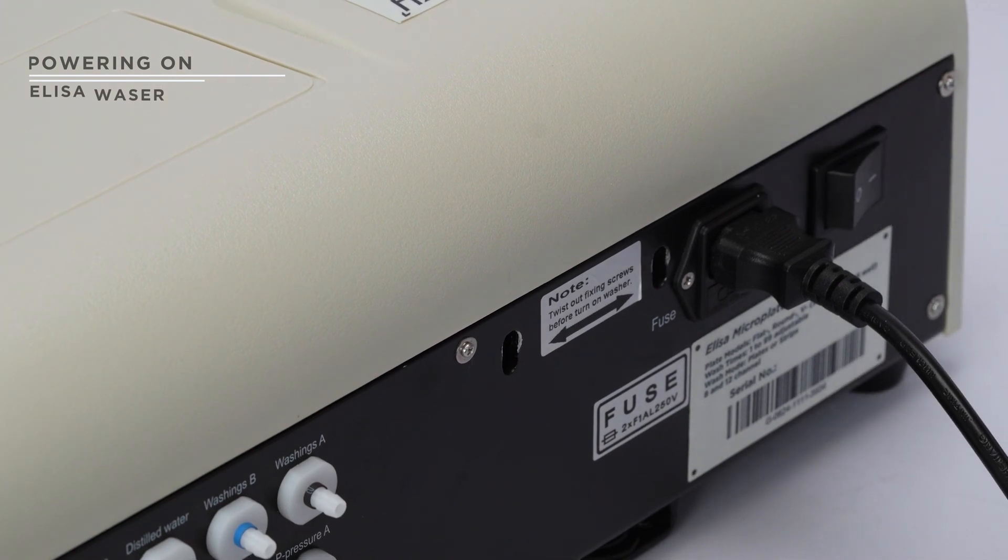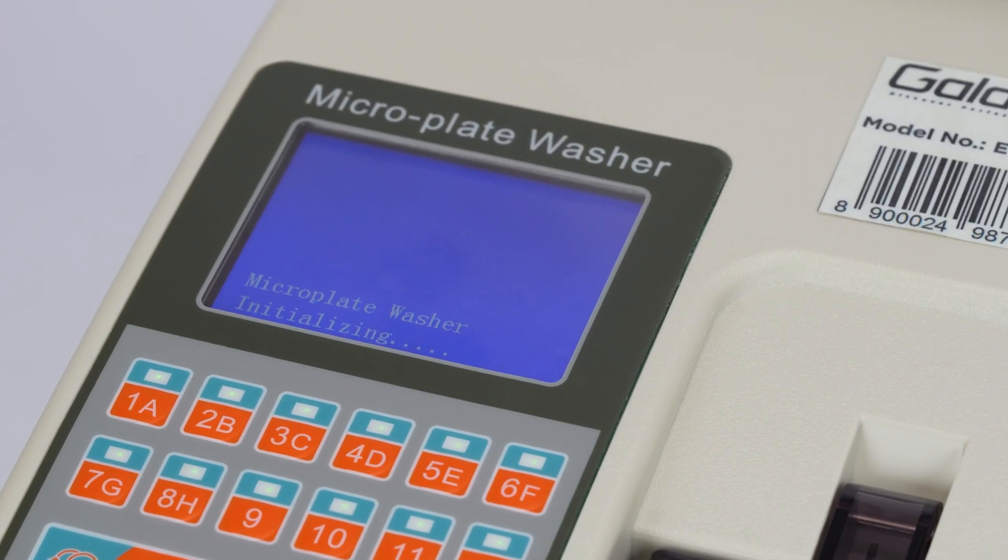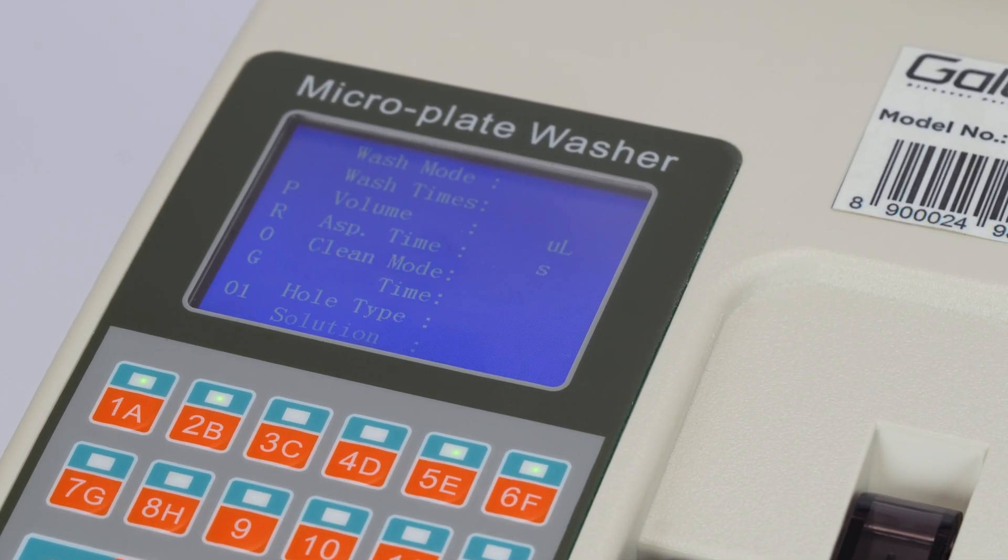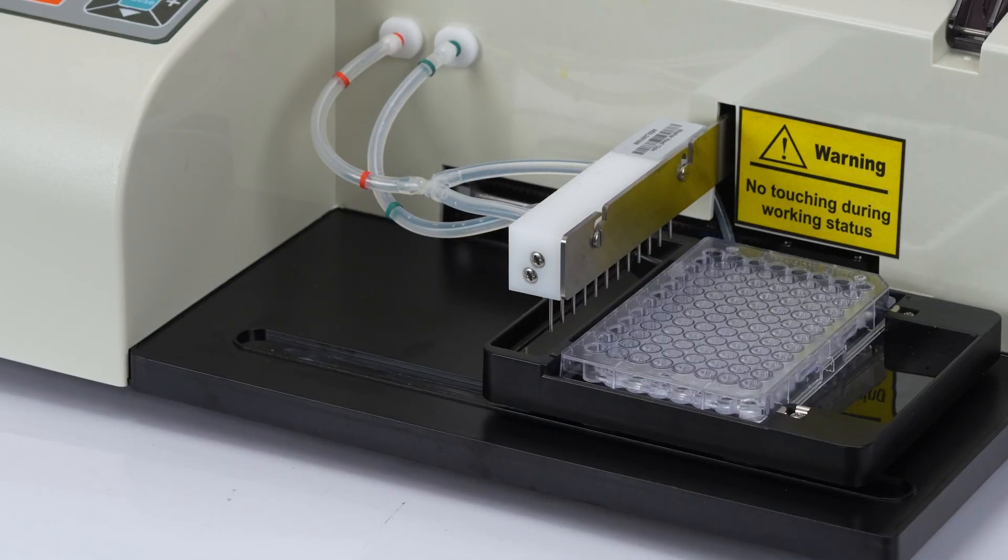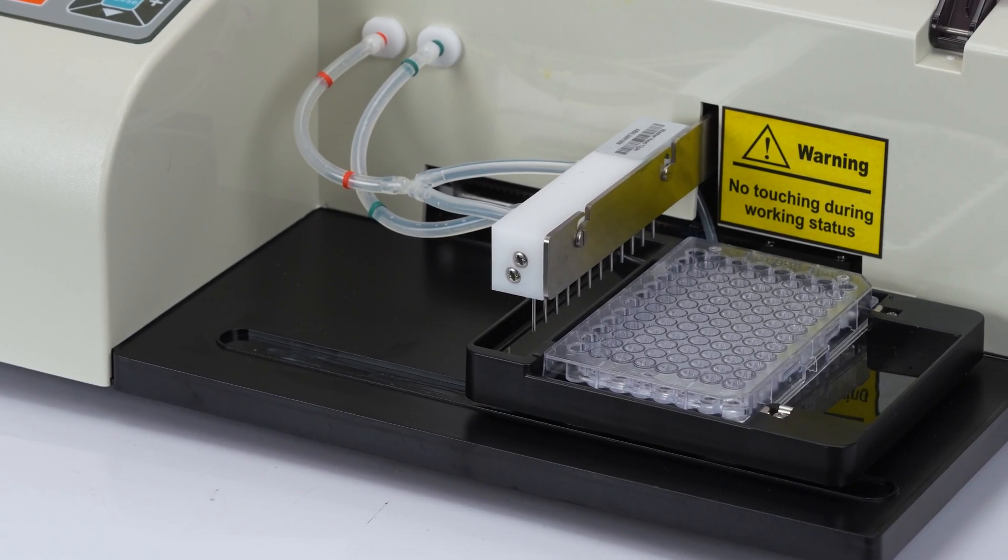Turn on the power switch. Once the machine is on, it will undergo self-initializing. Next, set the washer head position and adjust the settings for your microplate.